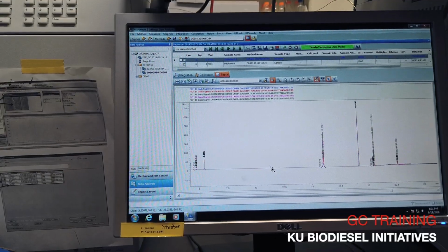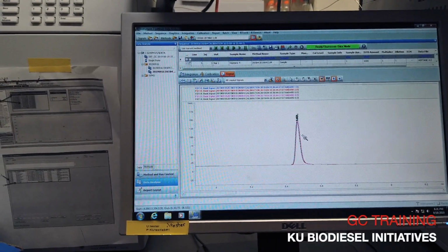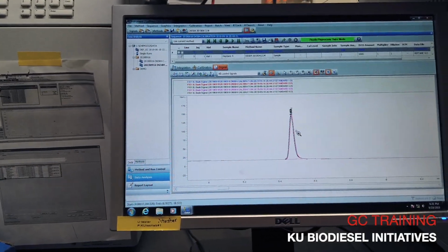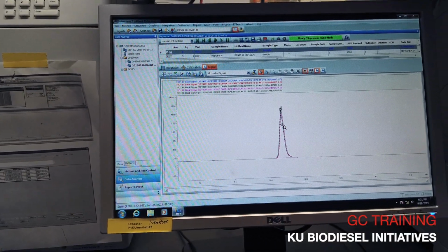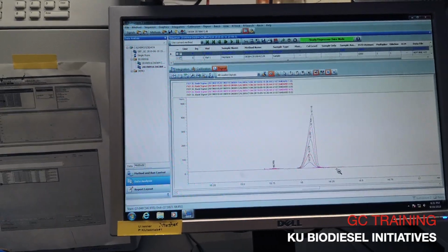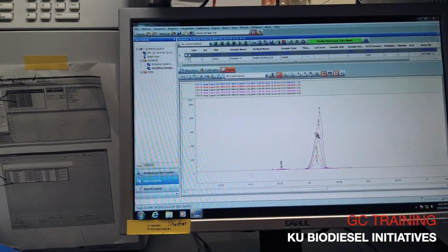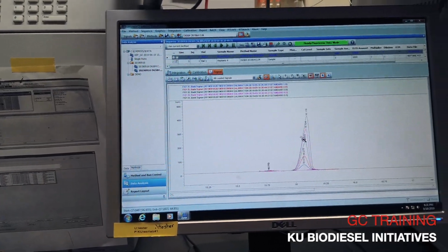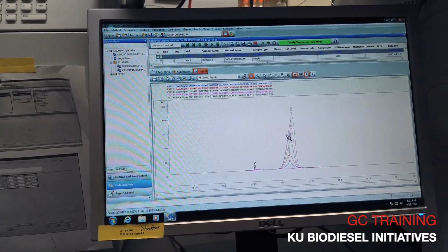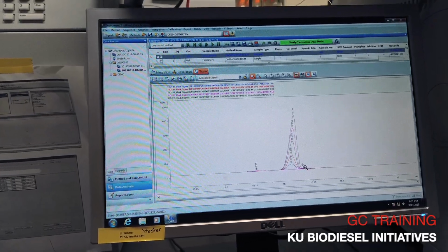So this looks like this is our butanetriol, because this is basically sitting right on top of each other and they're not really growing. This is our monolein. So this is kind of like a conflicting thought on what to do for stuff that's over on the side.